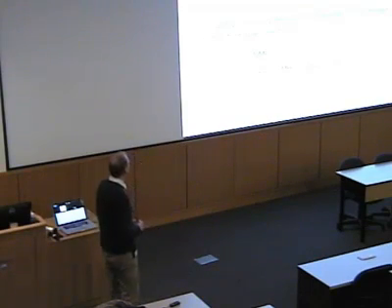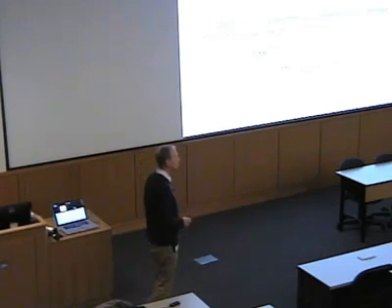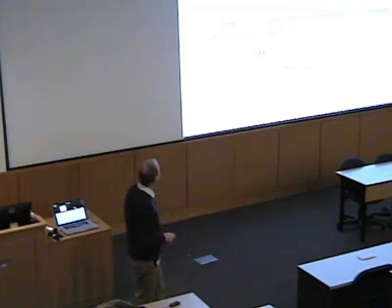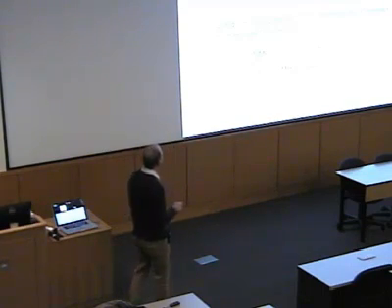Okay, so that, of course, is also very much the basis of NMR spectroscopy, which I think most of you will be fairly familiar with. But there, of course, we would be looking at the nuclear magnetic moment. And so the real fundamental difference between NMR spectroscopy and EPR spectroscopy is the size of the magnetic moment and the differences in the frequencies. Right?